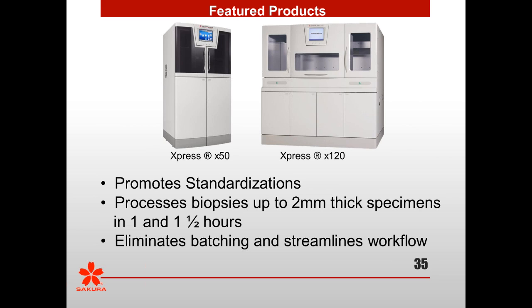Well, animal tissues are always a little different than human tissues. They have different protein makeups, and when you look at using conventional processors, they will have entirely different protocols. Again, if you're talking about a research project or protocols, you're going to have to look at what you want to achieve. I personally would say that if you use a processor that has a minimal effect of reagents and time on the tissue, then you can more properly control those research samples for the particular type of fixative and what your treatments are going to be to those samples. That is going to be even more critical in a research project.